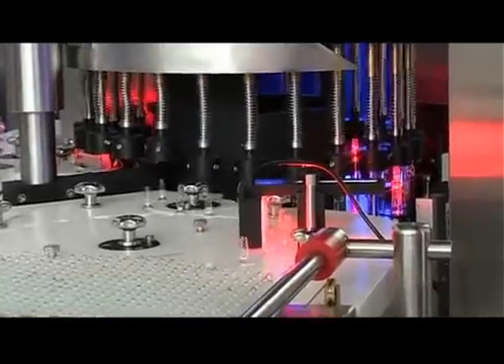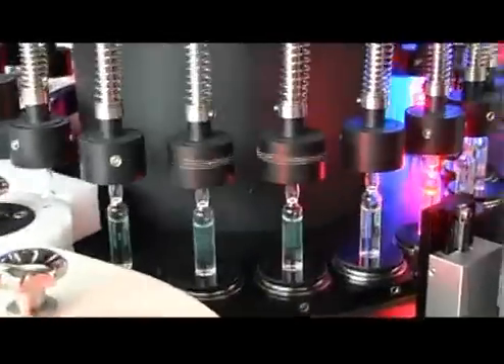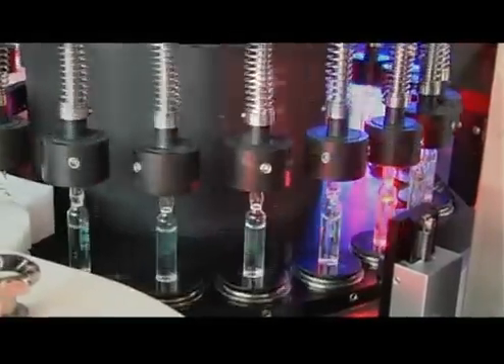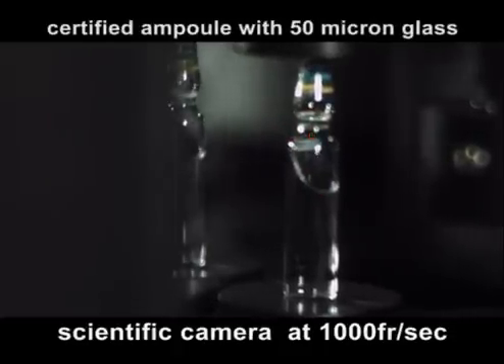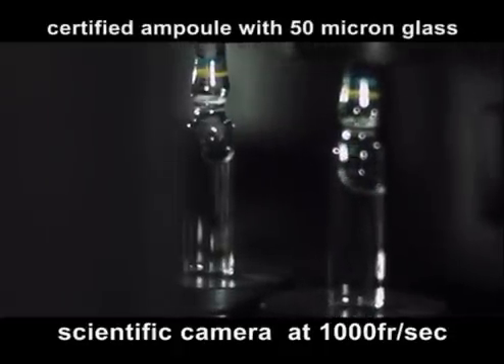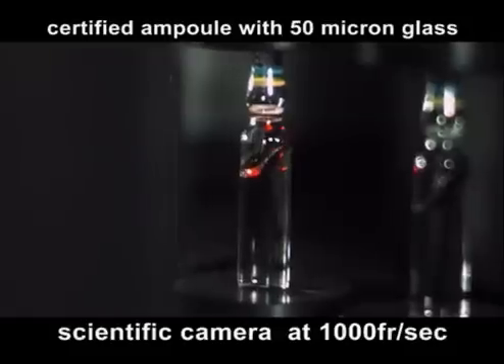Subsequently, the ampoules are introduced into the main carousel where centrifugation is performed for each ampoule at three stations. Video camera TV2 performs an inspection of the ampoule using as its source of illumination a high efficiency LED located at the lower level, allowing for analysis of reflecting particles.